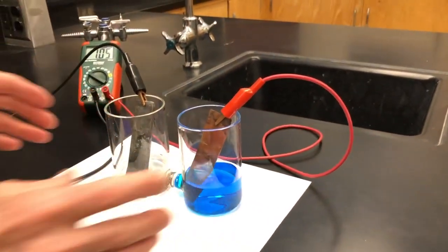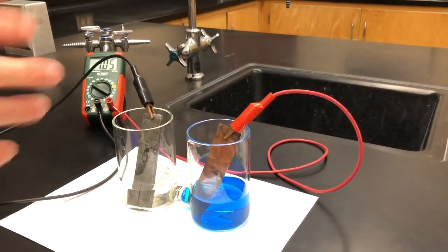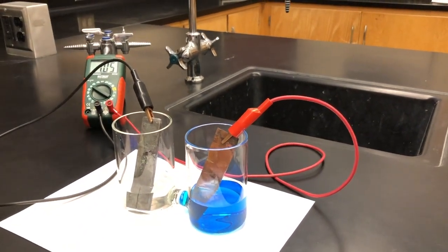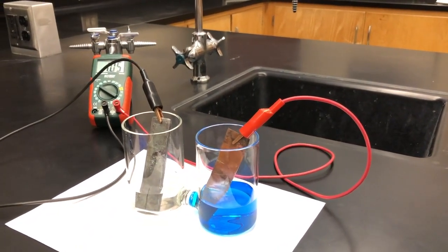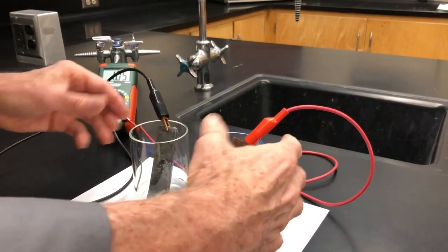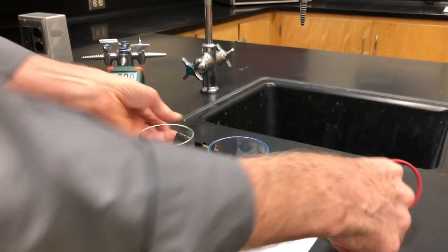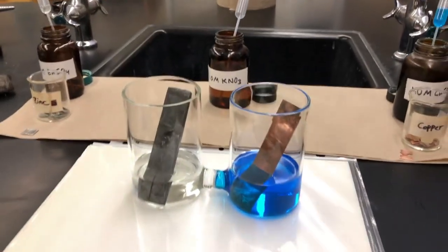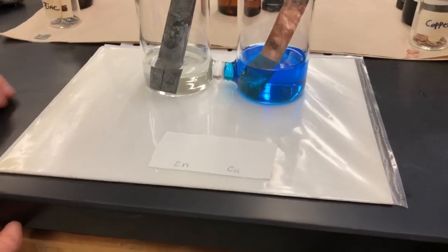Now what we're going to do — we could do this with beakers and large amounts of solution and big pieces of metal, but we're going to shrink this down to a much smaller scale and do microvoltaic cells. So let's move this apparatus over here and show you how we're going to do our microvoltaic cell.